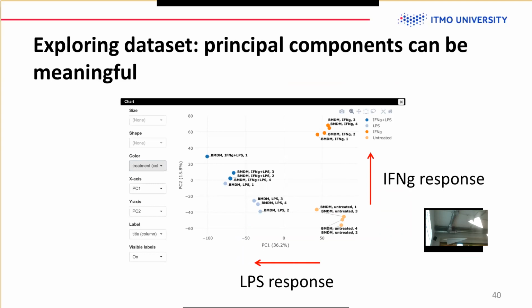This is PC1, the first principal component, PC2, the second principal component, and then you can select PC3 and so on. They will be explaining smaller and smaller parts of the variation. If you have diverse data, you can look at the higher principal components, but usually even the first two explain a lot, in particular if your data set is a mouse one and a pretty straightforward one.